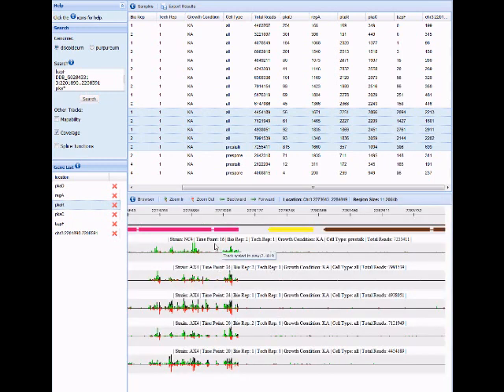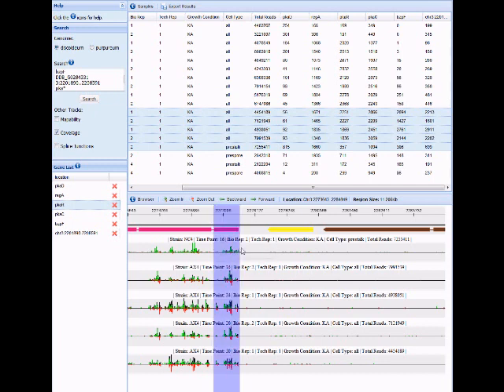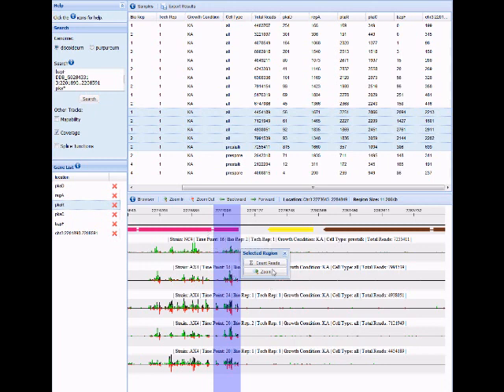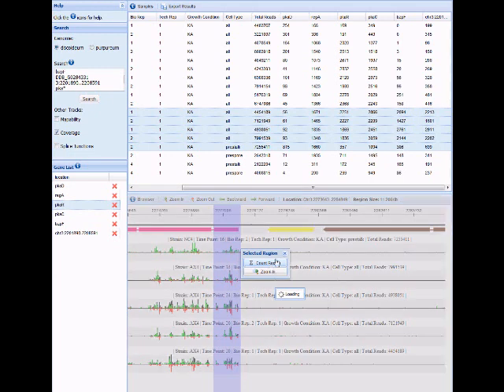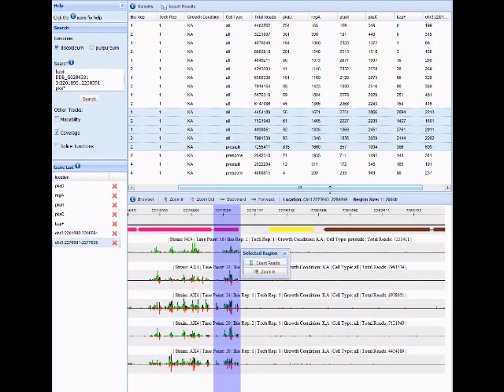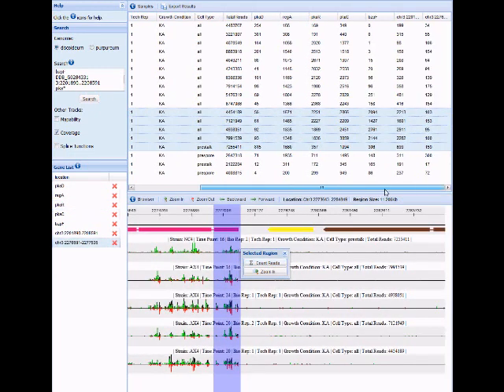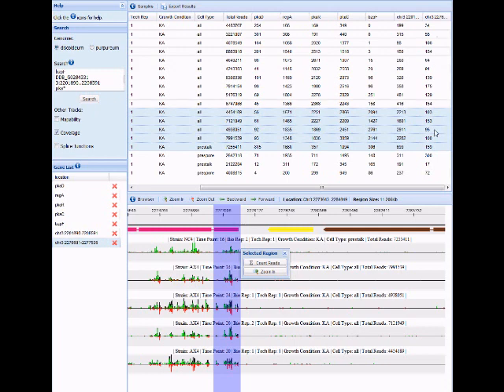Let's say now you're specifically interested in the read counts for this last exon of this GFLD gene. You can highlight that region and get read counts. Now the sample panel again will populate with that region and show you the read counts across all of the samples.